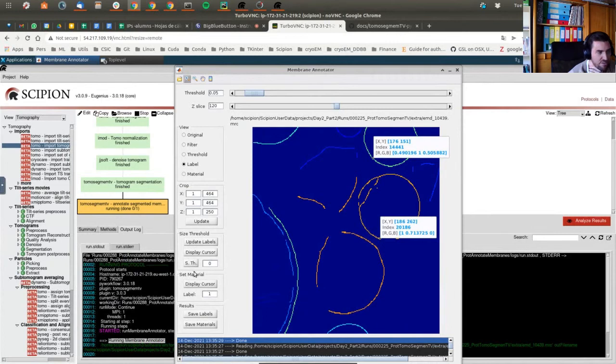If there is a lot of noise, even if the threshold value takes you to a scenario in which small things are bothering and making your structures dirtier, you can measure the sizes and use the size threshold button to remove them.